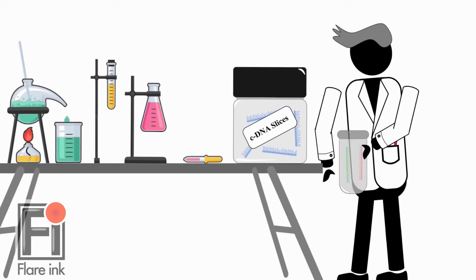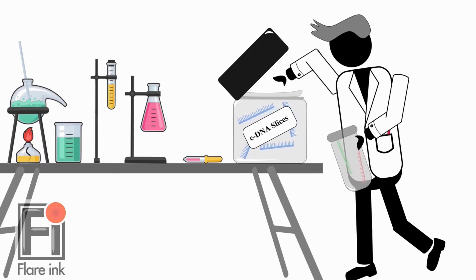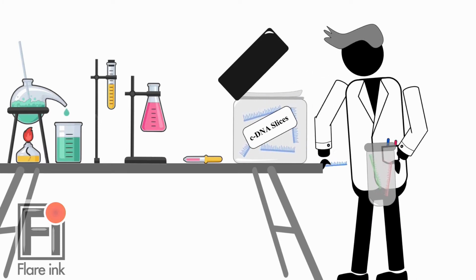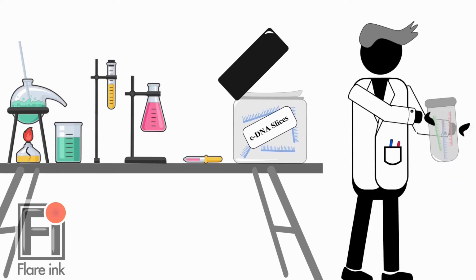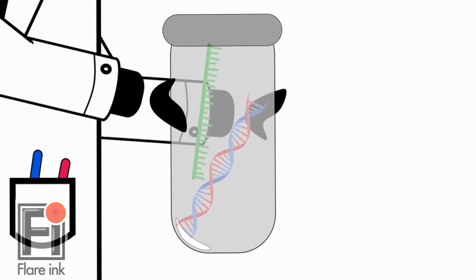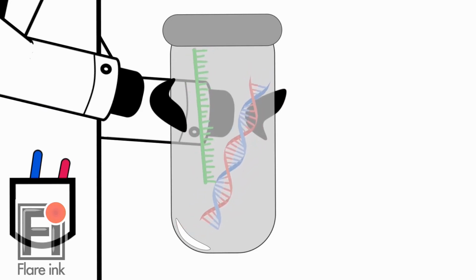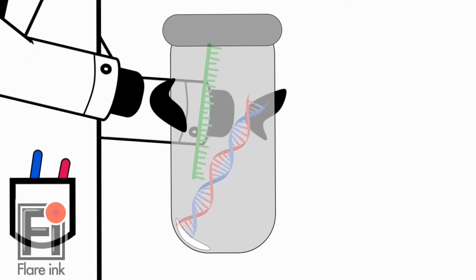Once your sample preparation is done, you fetch a gene, the expression of which you want to study in your sample, and you place them along with your sample to check if they hybridize. The hybridization occurs only if your sample expresses this particular gene. The sample which does not hybridize gets removed from our mixture.